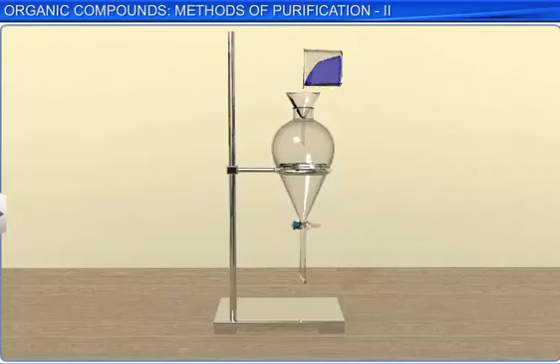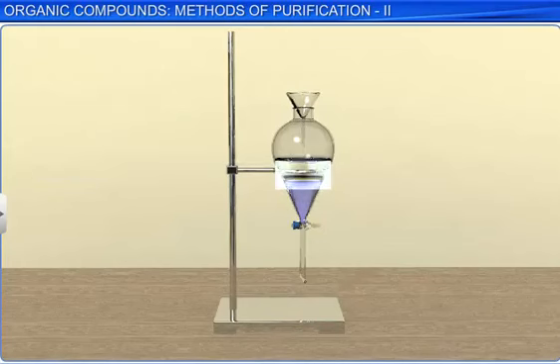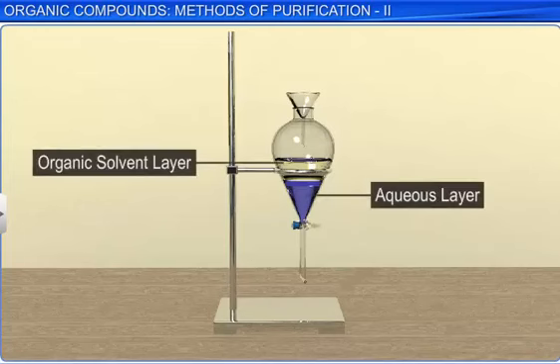Differential extraction is a purification technique that is used to separate an organic compound present in an aqueous solution with the help of an organic solvent in which that compound is more soluble than water. The basic requirement of the organic solvent is that it should be immiscible with water so that the organic and water layers can be easily separated.